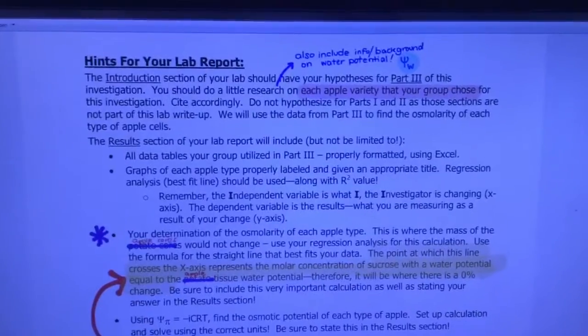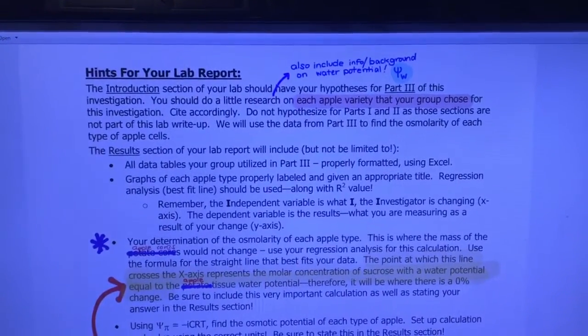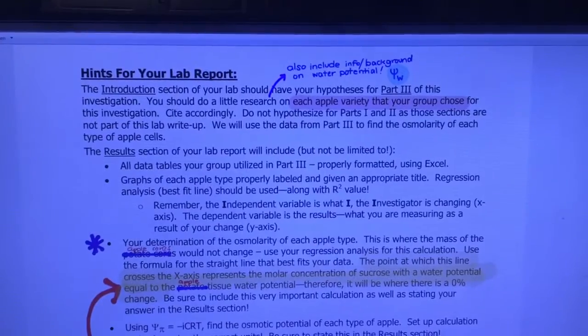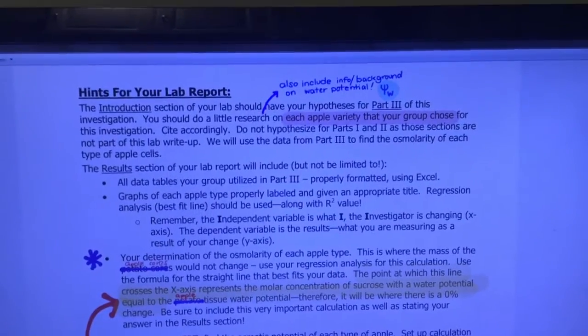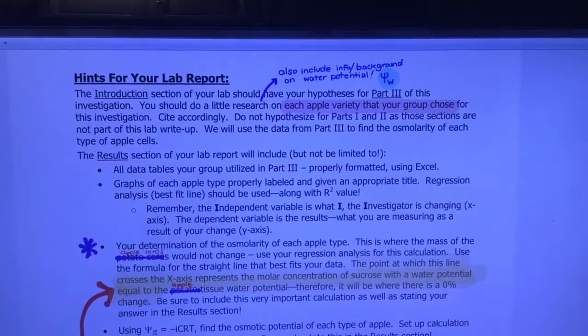For your variables, if I made some corrections in your lab notebook for your pre-lab, please use them. Independent variables, dependent variables, specifically what you're measuring, and as many things as possible that you're keeping the same, the constants. One of those, of course, would be what you guys said about the apple cores. Be specific on what you meant by that.